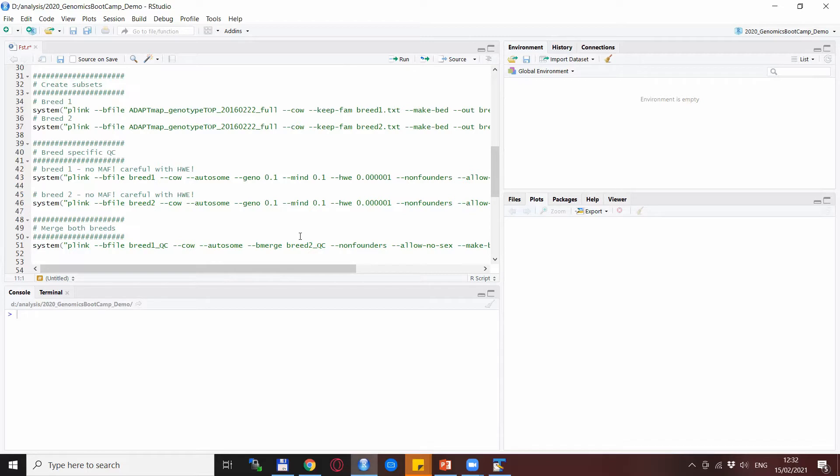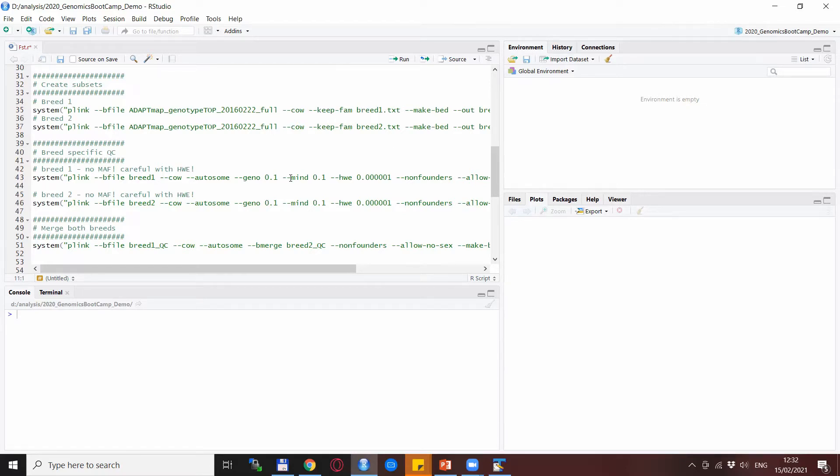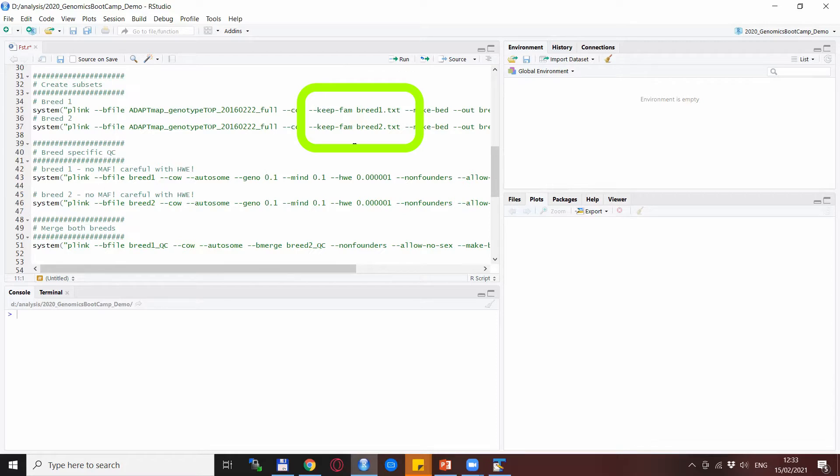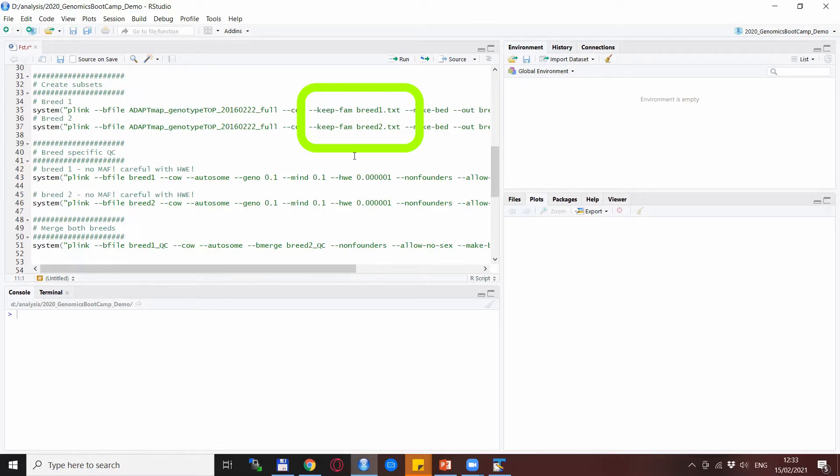For that we will use Plink again from the full data and the --keep statement, as was detailed in a previous video. We will use --keep and the text files breed1.txt and breed2.txt.